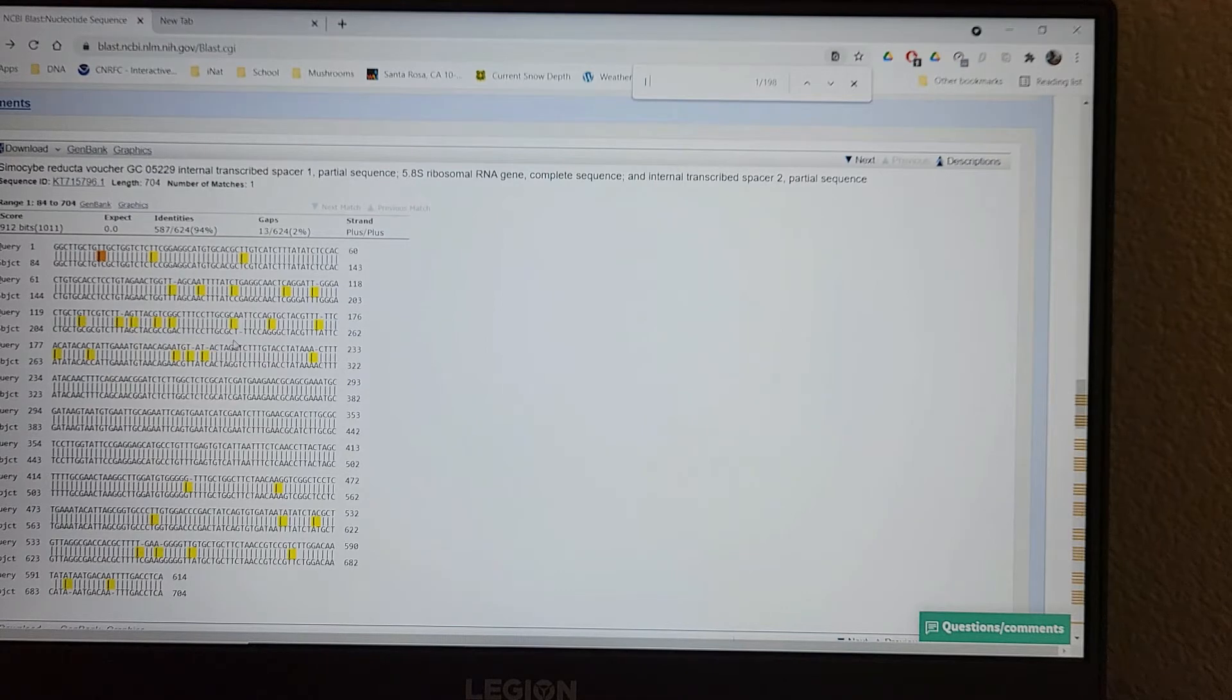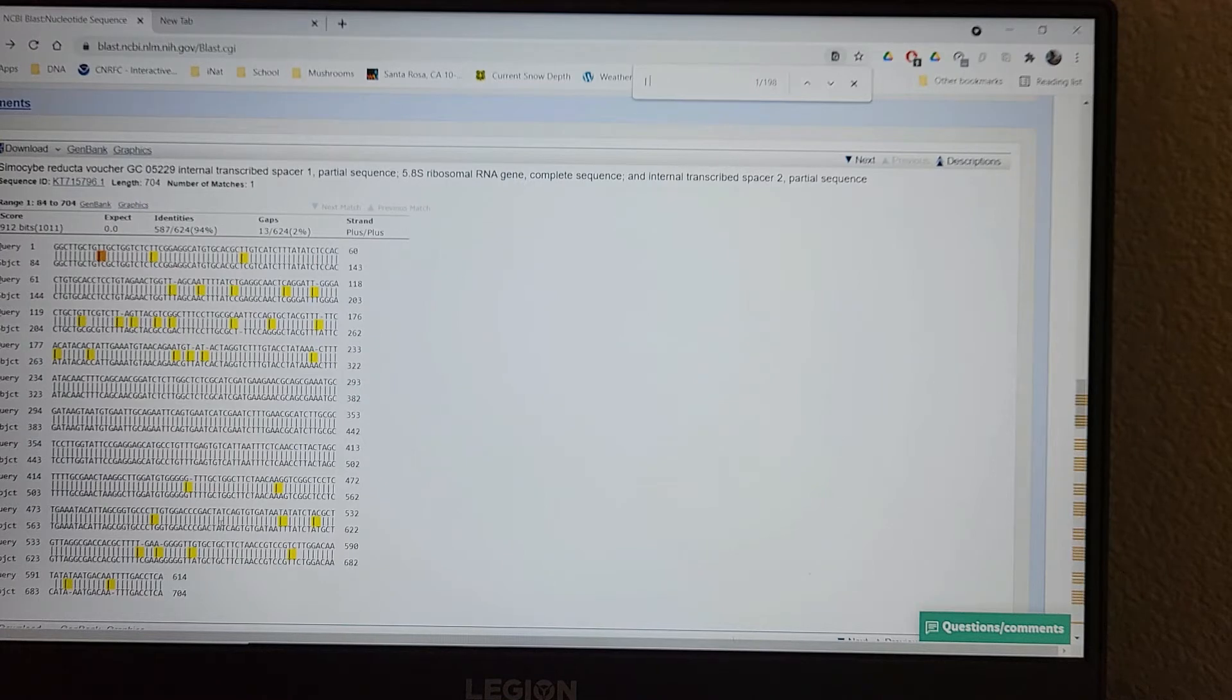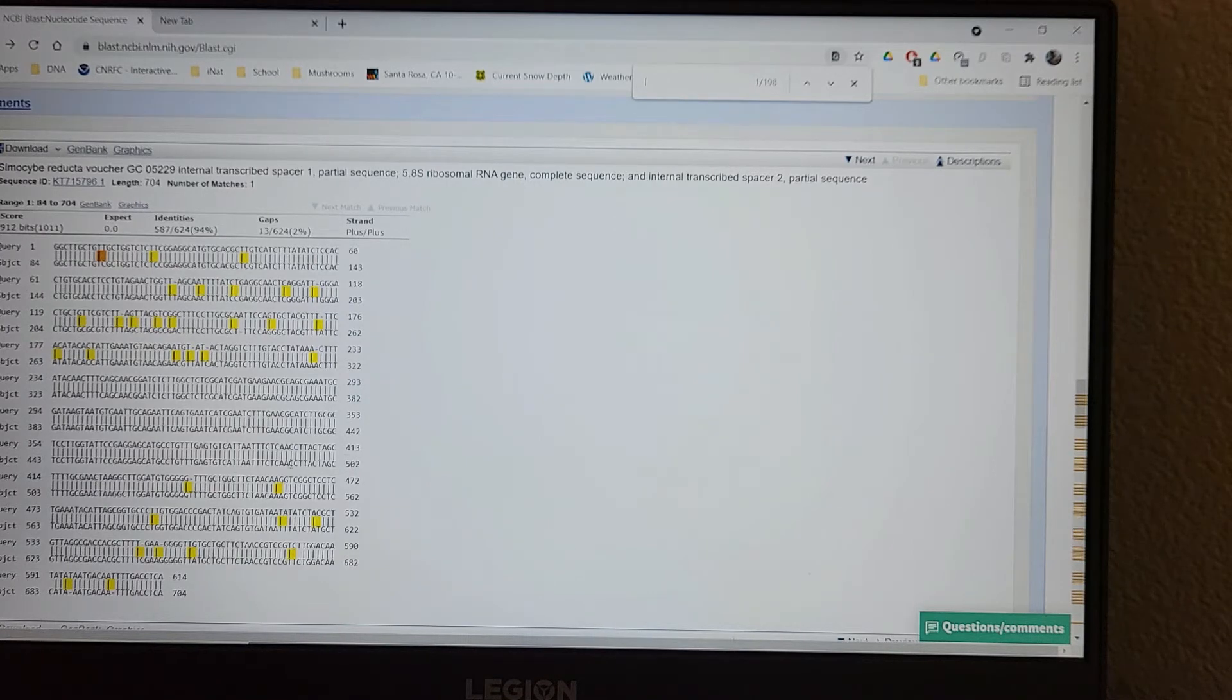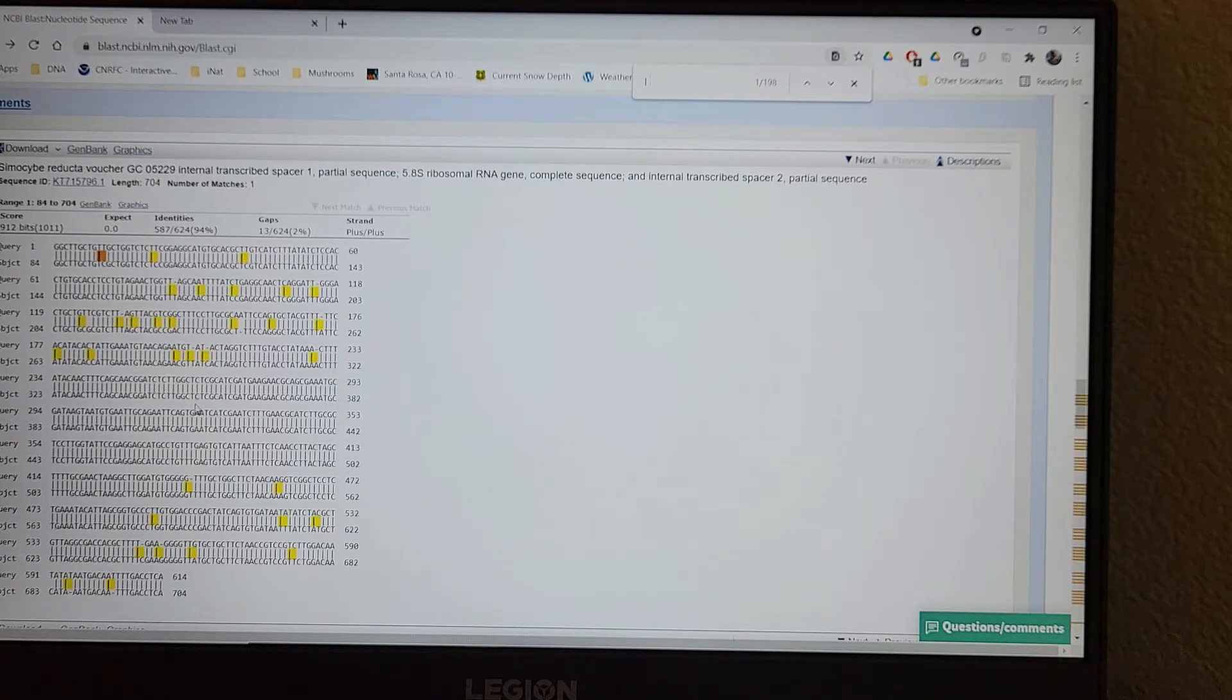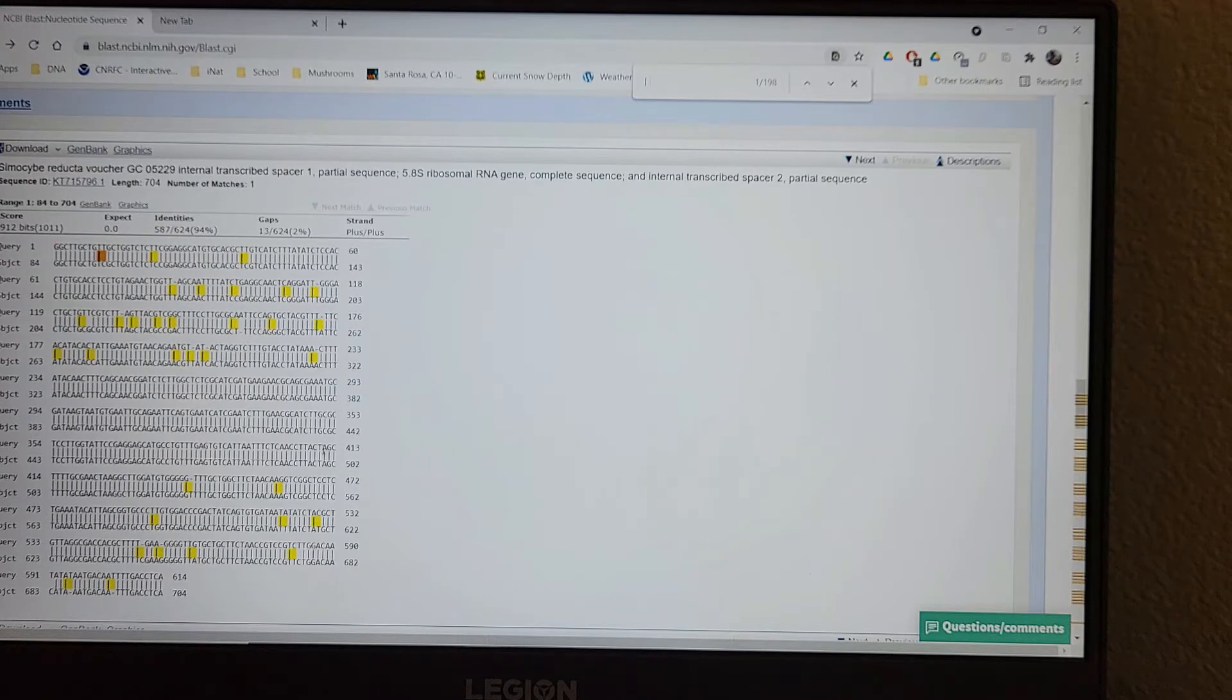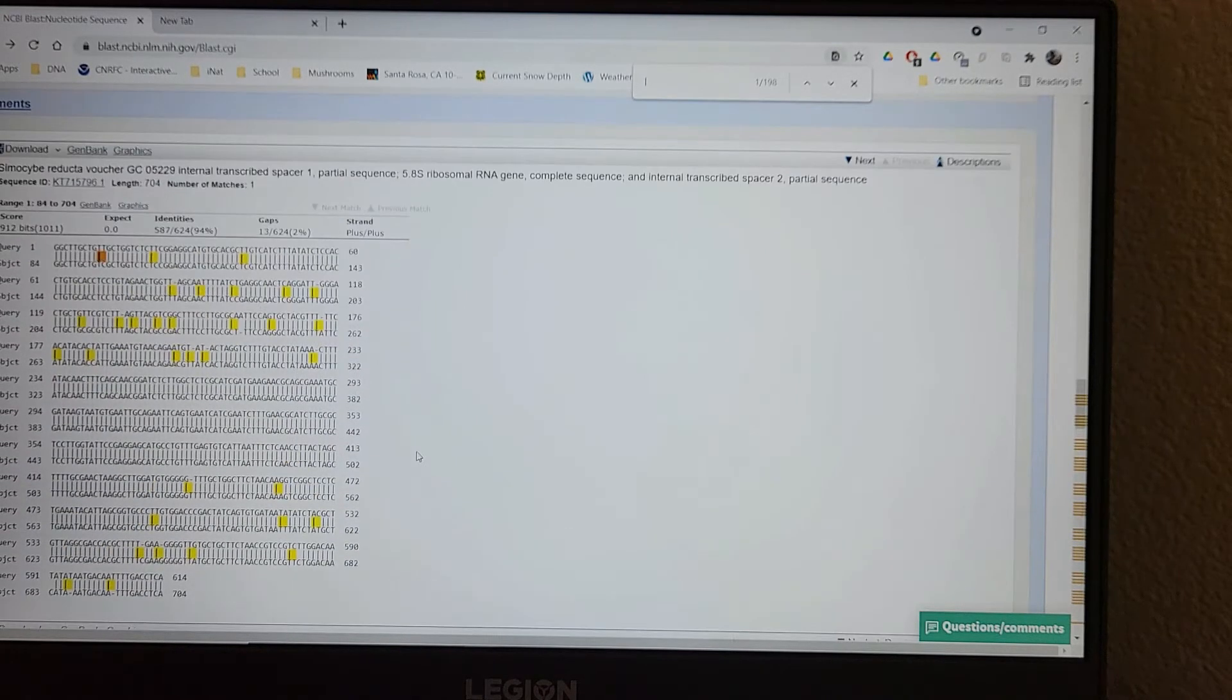And then it'll highlight everywhere where the sequence is different. Now you'll notice it's different up here. It's also different down here. But over here in the middle, it's mostly the same. And so why don't you guys try to figure out why that is based on what you've learned so far about this. We'll talk about that in a bit.